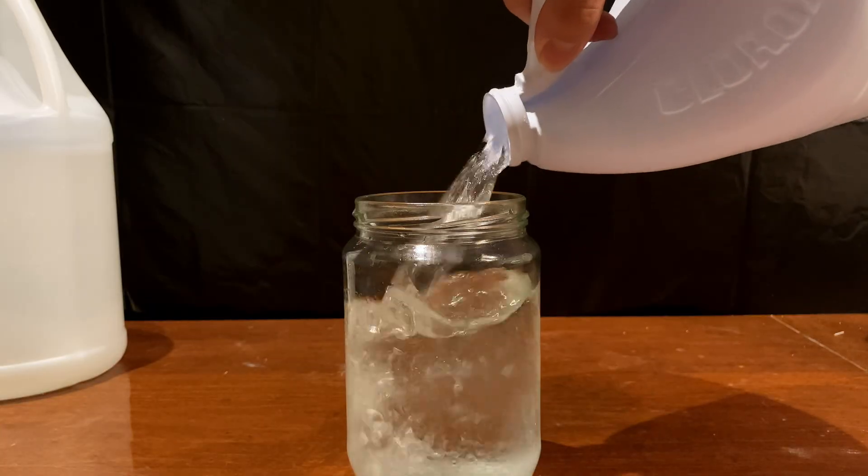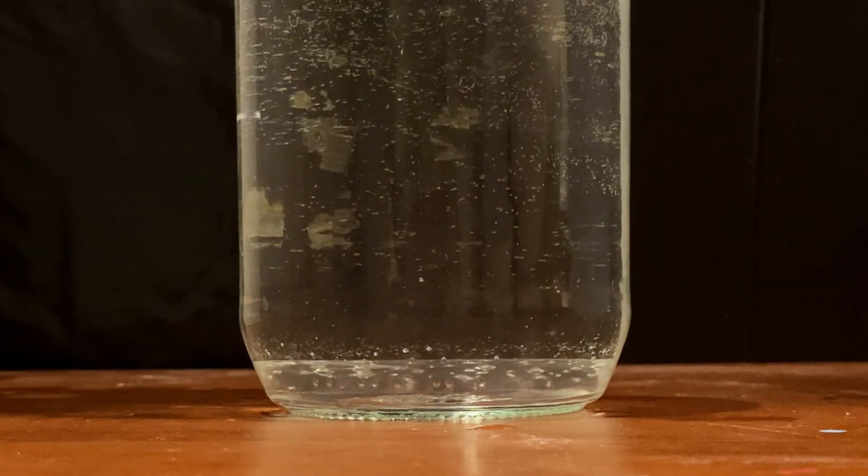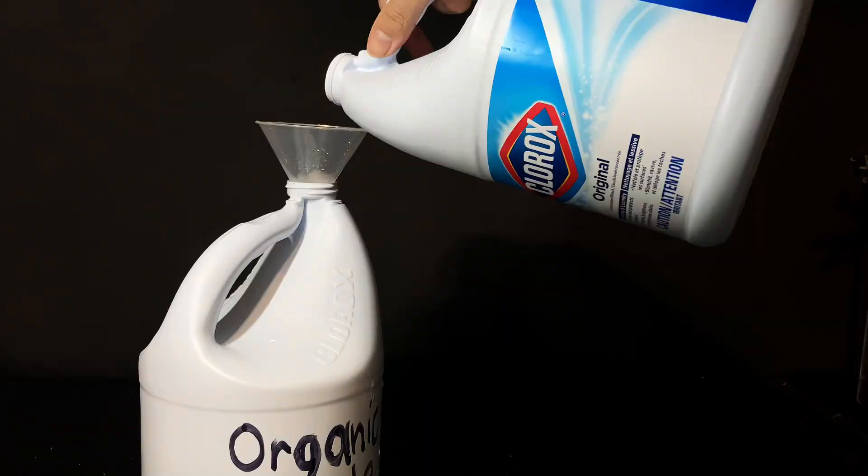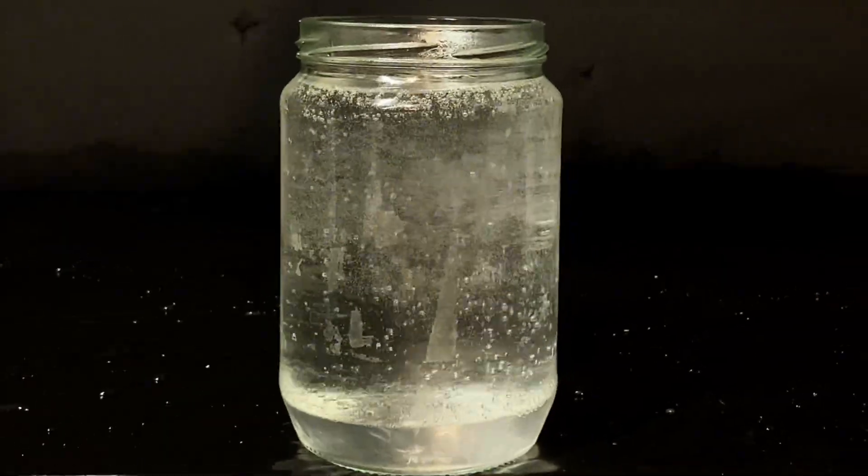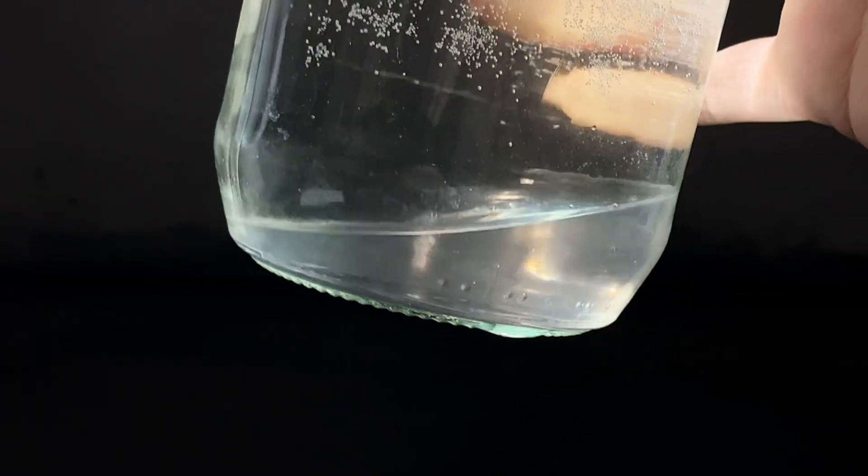As you can see, the chloroform from this batch sinks to the bottom of the jar, and it looks pretty cool. Give it some time to settle as some drops may still be stuck at the top. The second batch kind of went the same way. After pouring off all of the side products and water on the top, I poured the chloroform into the same jar, and you can see how I got a good amount of it in the end.